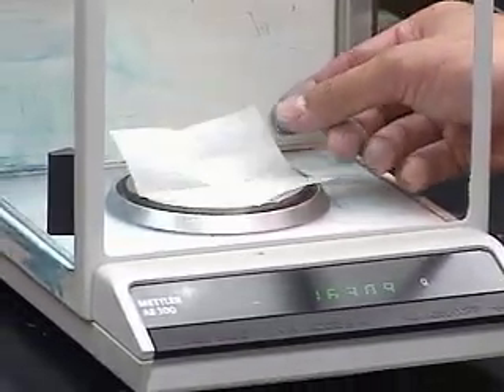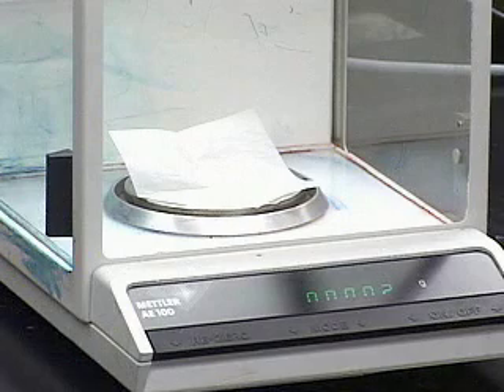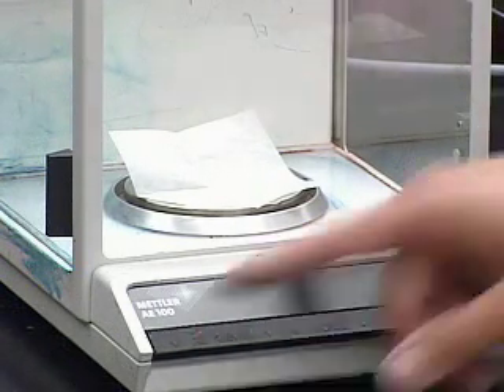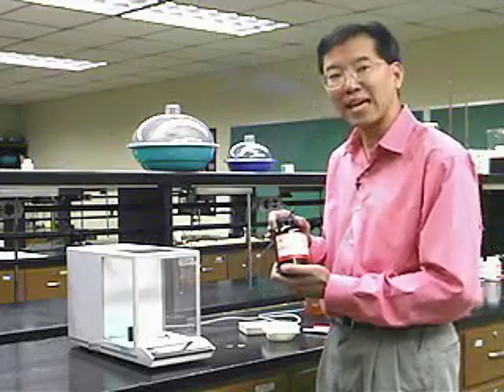Let's use the weighing paper for this application. Place the weighing paper on the balance pan, slide the door closed, and hit the tare button — it goes to zero, accounting for the mass of the weighing paper. If it doesn't go all the way to zero, just hit the tare button again. Now we're going to weigh out 100 milligrams of potassium permanganate.